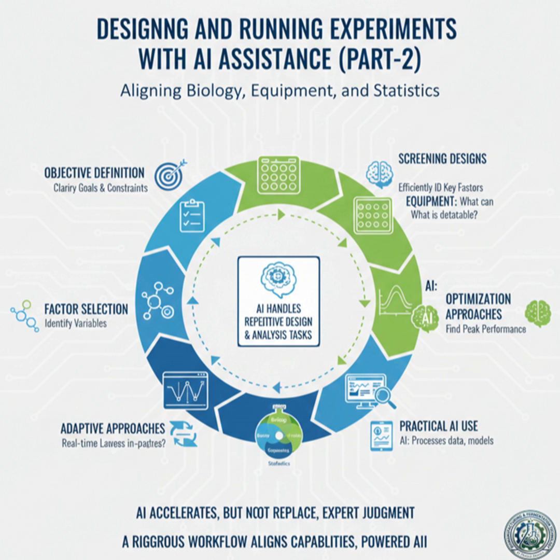20 factors at just 2 levels. That's 2 to the power of 20. That's over 1 million runs. Yeah, we definitely don't have that many bioreactors. Not quite. So the goal of screening is strict filtration. You want to separate the signal from the noise.